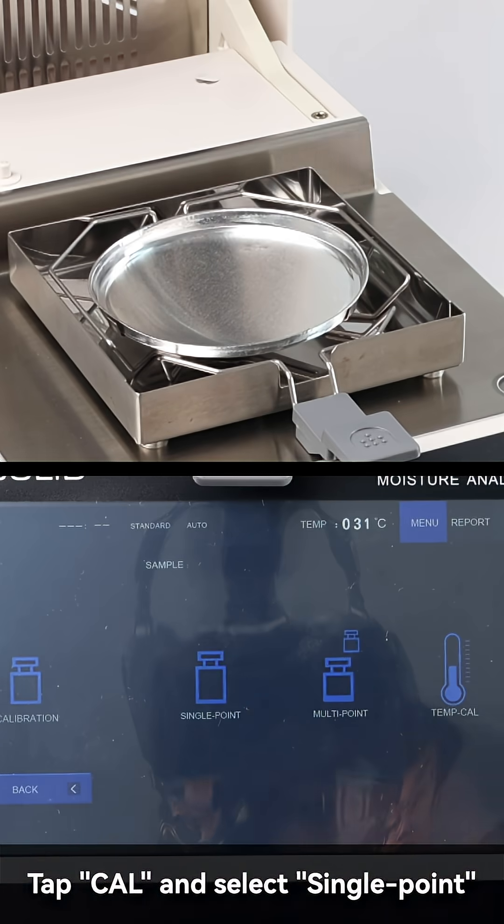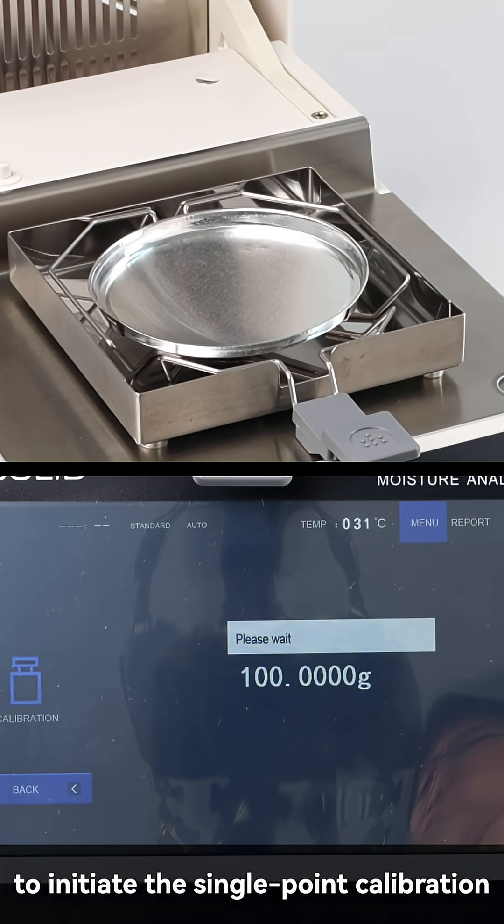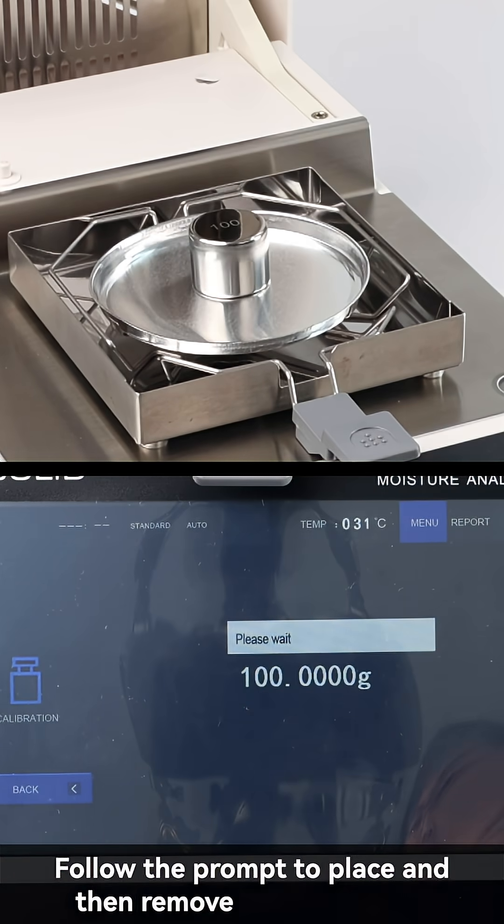Tap calibration and select single point to initiate the single point calibration. Follow the prompt to place and then remove a 100 gram weight.